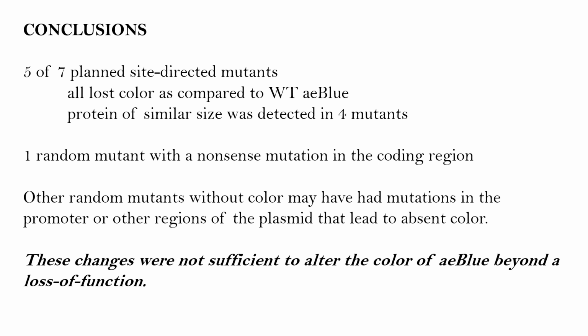So in conclusion, we were able to do 5 out of the 7 planned site-directed mutants. All of those lost color. There's also one random mutant with a nonsense mutation. Our mutations, however, were not sufficient to change the color of aeBlue beyond a loss of function.